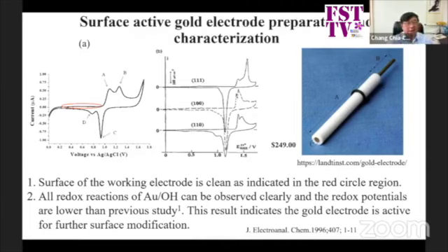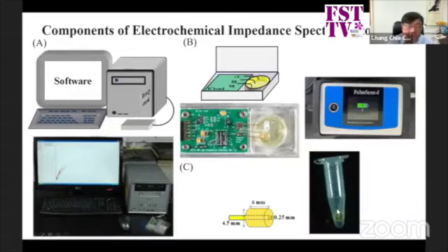So it means that when a student uses these kinds of electrodes, they need to polish them, measure their performance, and characterize them to see how their structure is, here is 111 and here is 100, and make sure there is a lot of 111. Then they pursue the following bioconjugation. That's for only one test. But the problem, as I mentioned previously, is that the cost of $250 is not high for one electrode.